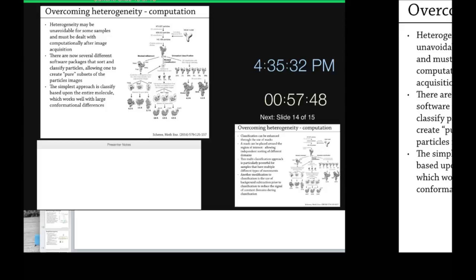Any questions about this extremely complicated reconstruction technique? Usually when we start classification, in this the original model had 3.7 angstrom, and it improves later, but why is it that the initial model has higher resolution and others have lower resolution?